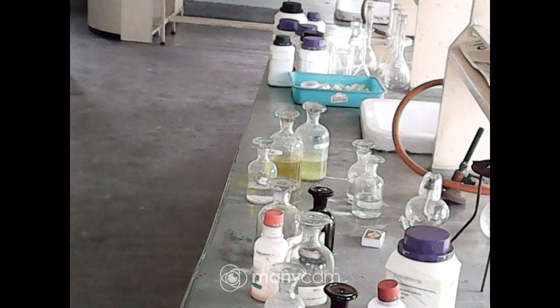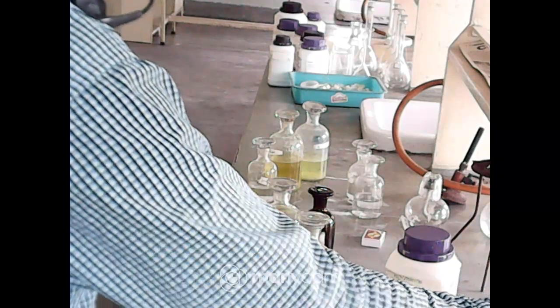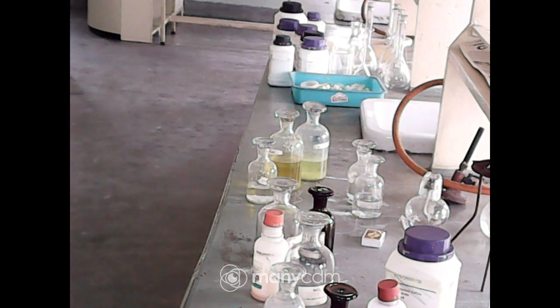And it is also an endothermic reaction because the test tube becomes cold. Basically all the reactions are exothermic, but this one seems to be endothermic. Okay, so we have shown the experiments today. One is for ammonium chloride, another one is for aluminium sulfate.